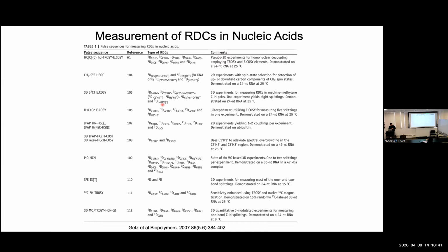How do you encode the scalar coupling in a line shape? That's an interesting idea. But in the medium of NMR, you can encode as you wish, right? So you have to encode the scalar coupling into some feature. Line shape is interesting. What else could you encode? How else could you encode scalar coupling? Into what feature of the line, besides its shape?